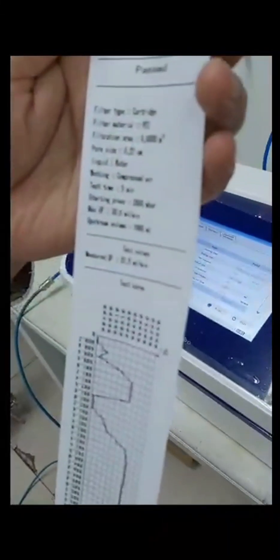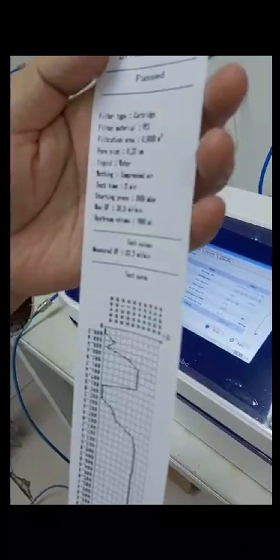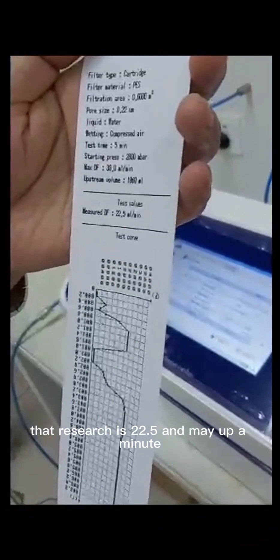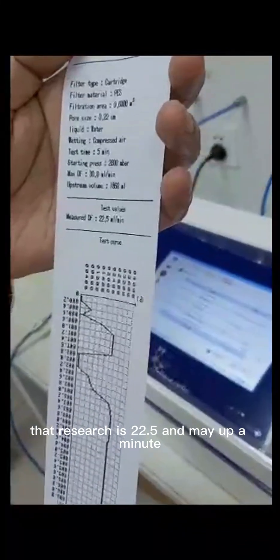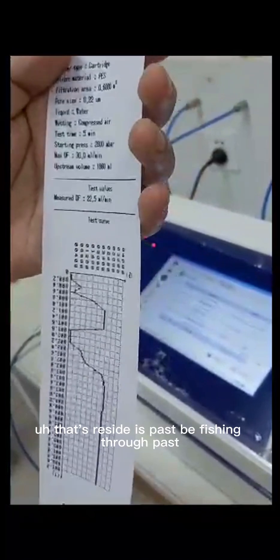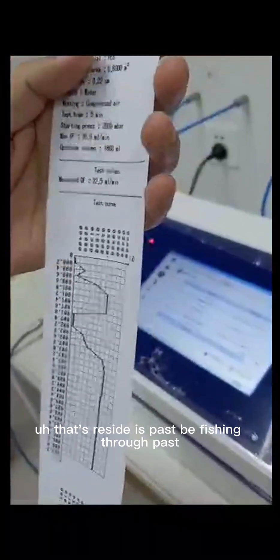You can see the test result. Diffusion fluid is 22.5 ml per minute. Test result is passed. Diffusion fluid is passed.